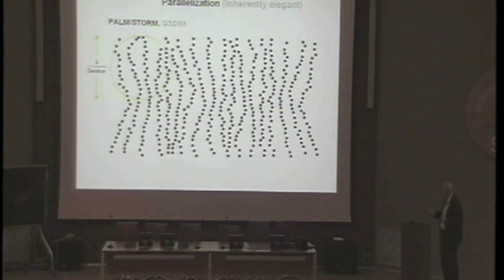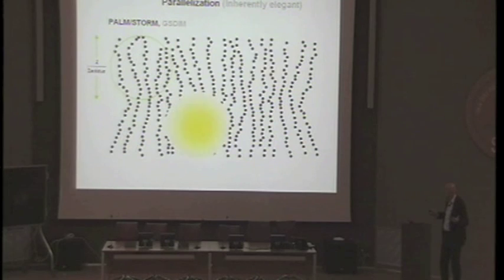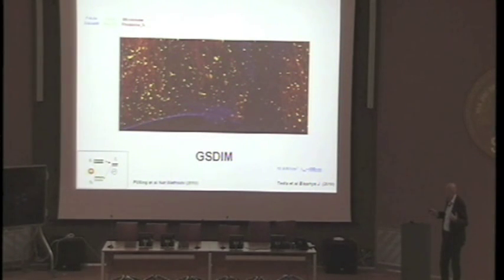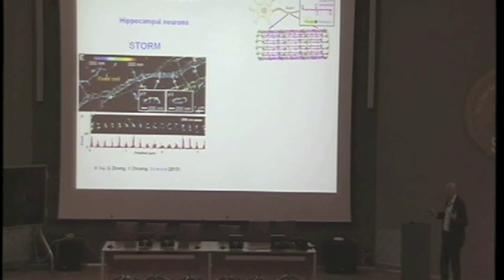You can elegantly parallelize this stochastic method because you can see large areas more or less instantaneously. And so it clearly has advantages. Gives nice pictures, as you can see in here. Beautiful application must be shown. Recently, this is by the Zhuang group at Harvard.